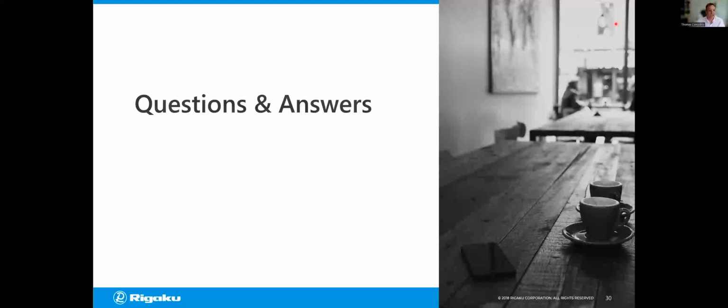Okay, so I'm going to skip down to another question that follows from that: how do you determine the background? Are you using an empty sample holder, or is it done mathematically? Yes and yes. For each of the instruments, we calibrate a baseline, and that is done by using silicon low background holders initially, and also silicon powder. A combination of those two sets up a calibrated baseline for each instrument. And again, anyone who's interested, I can take you through how to do that. So that is essentially how we do it, using both a low background holder made of silicon and silicon powder.